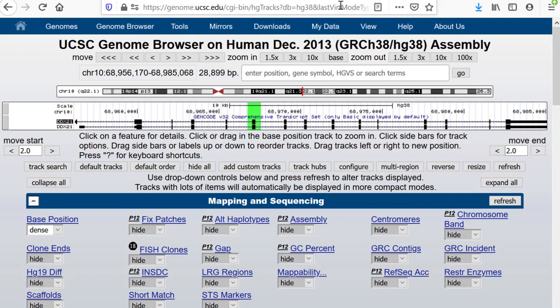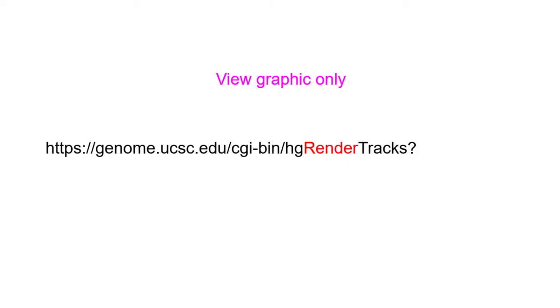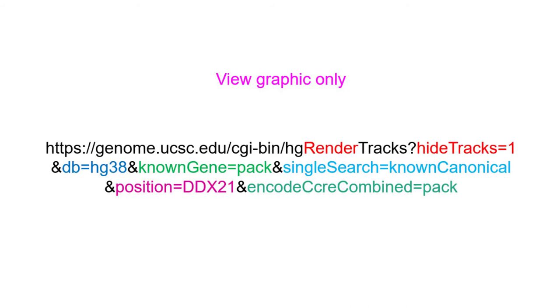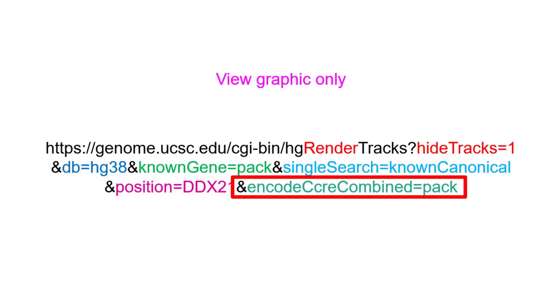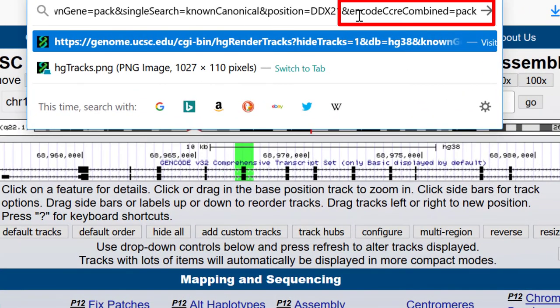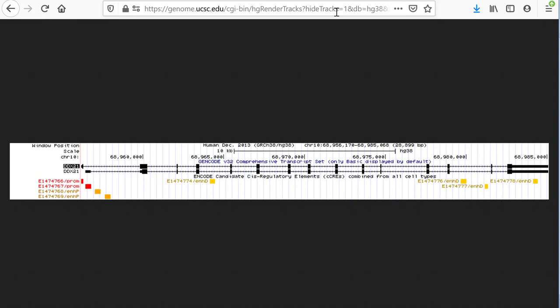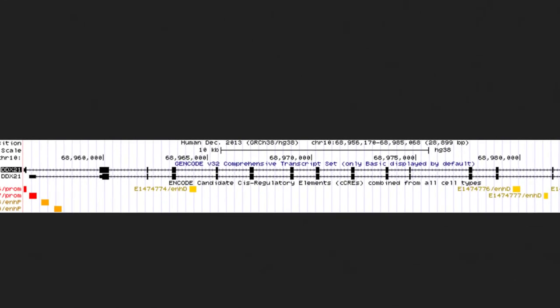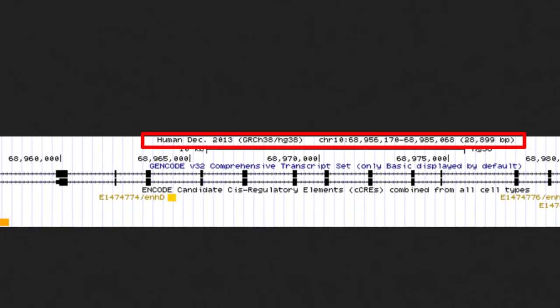One interesting variation on the URL is the situation in which you may wish to display or embed just the graphic image from the browser without all of the track buttons, documentation, and render track controls. In that case, use the CGI hgRenderTracks instead of hgTracks. For example, let's modify the URL by adding render to it and add the new ENCODE cCRE regulatory element track using ampersand encodeCcreCombined equals pack. This gives you the browser graphic only, with coordinates added to the top of the graphic. Note that highlights cannot be displayed as part of hgRenderTracks.